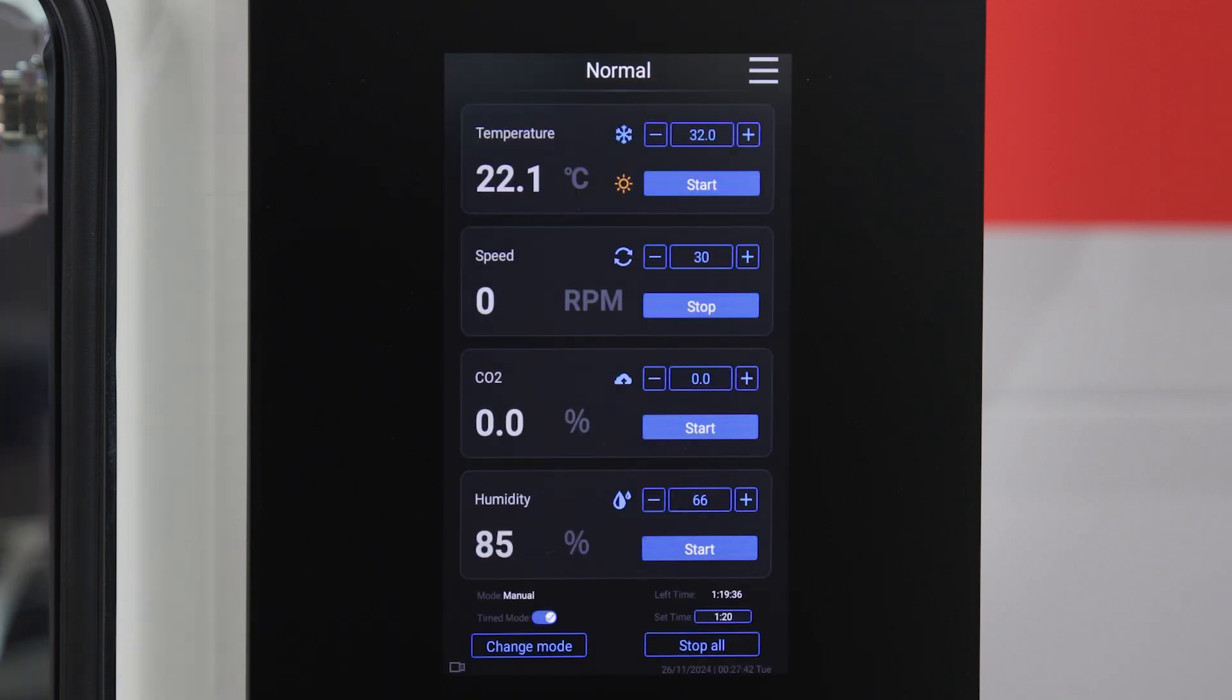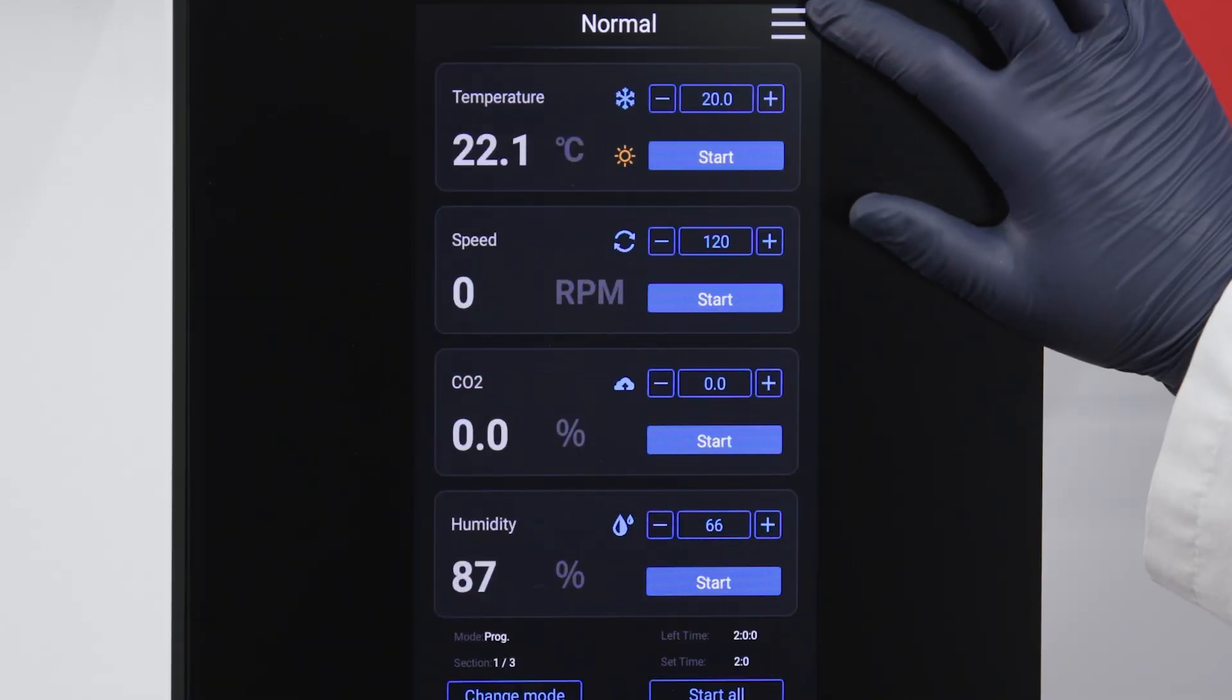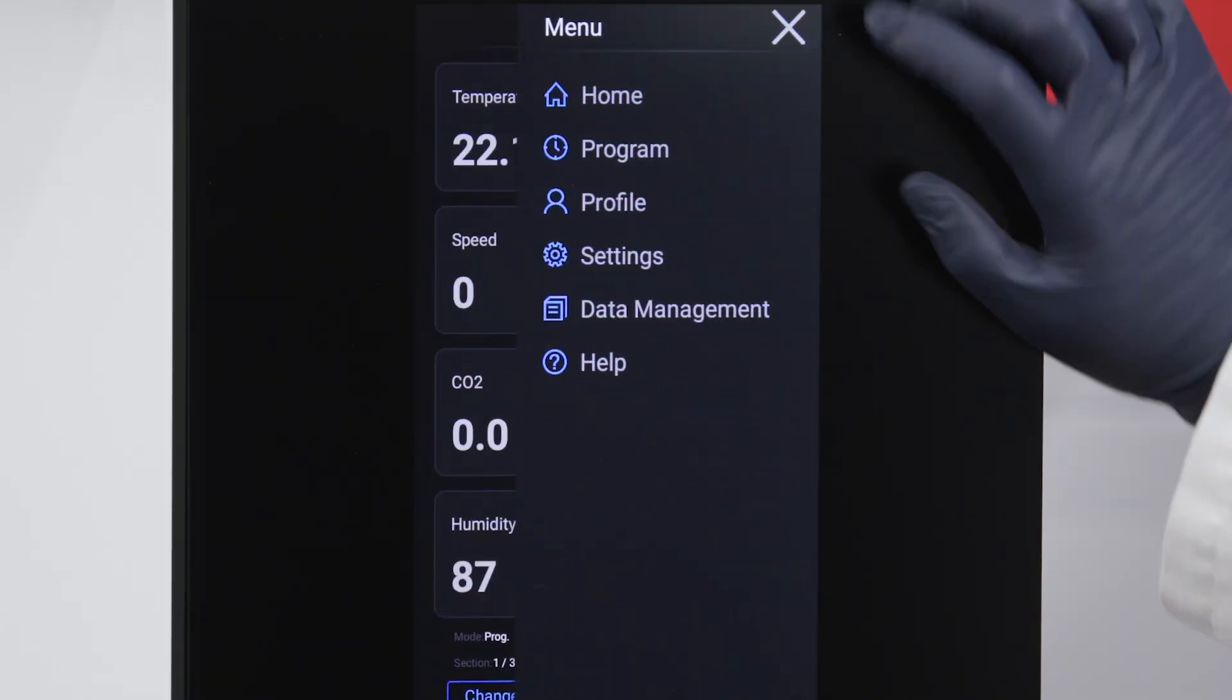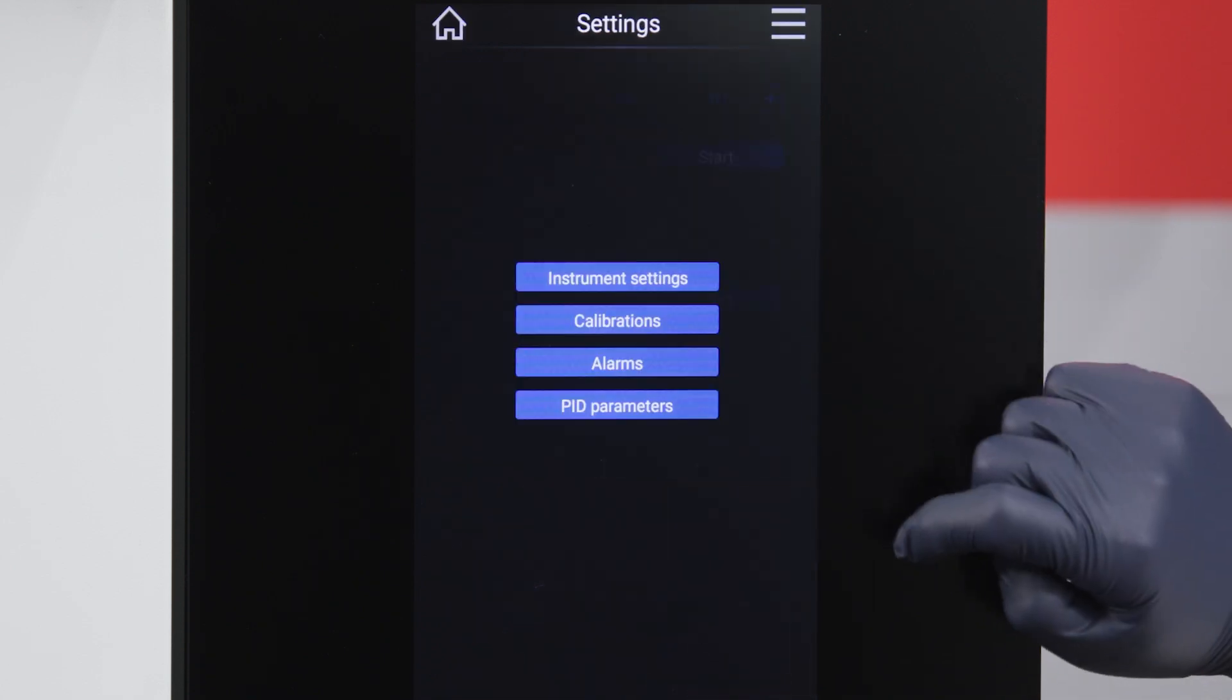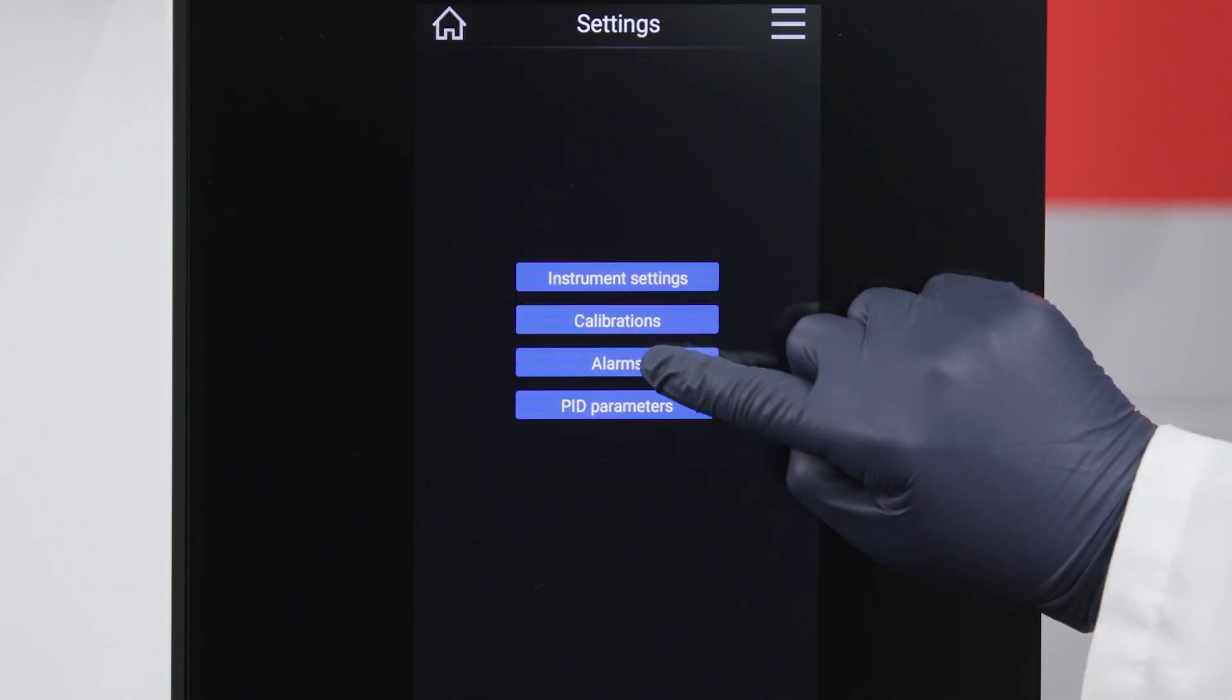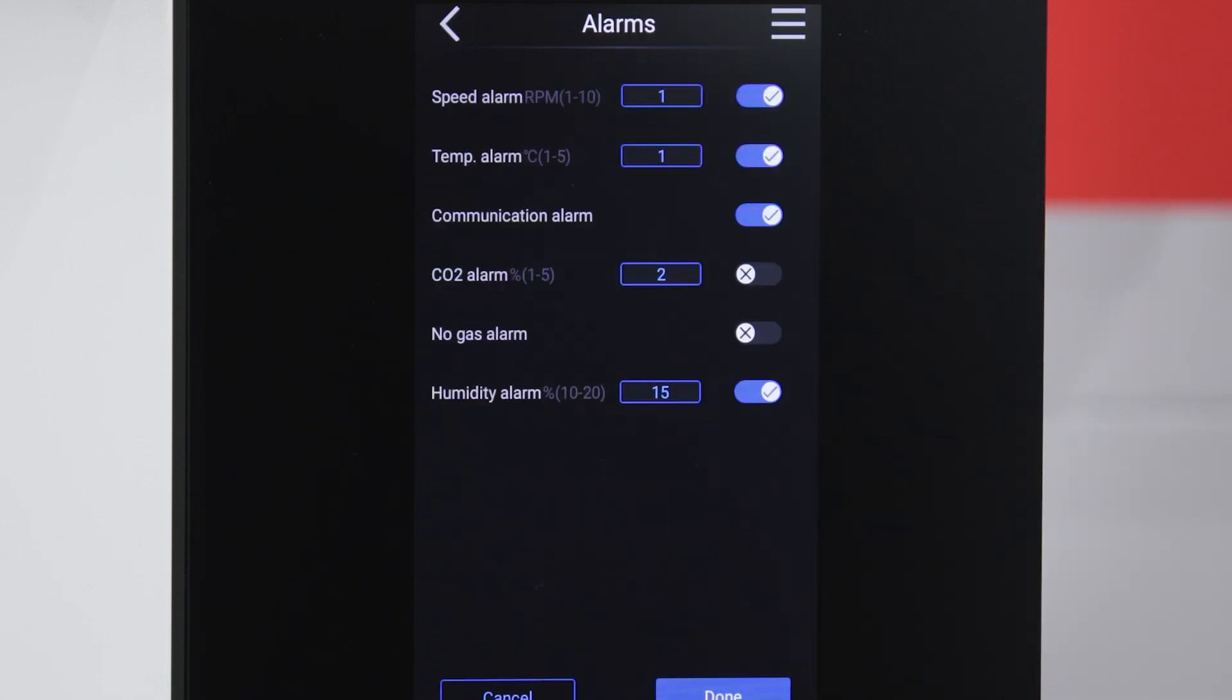To set the IntelliStack's alarms, access settings through the menu navigation. Tap Alarms to view the alarms interface.